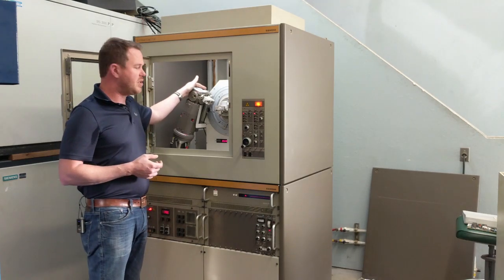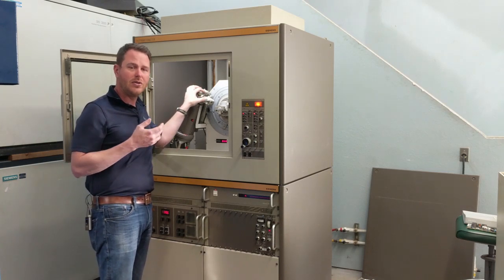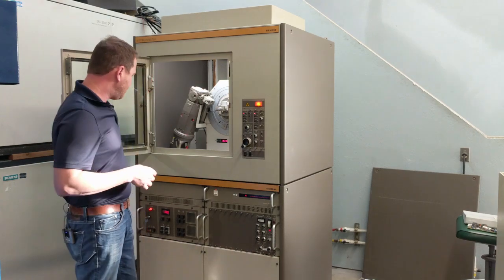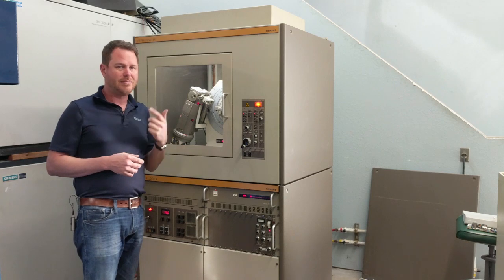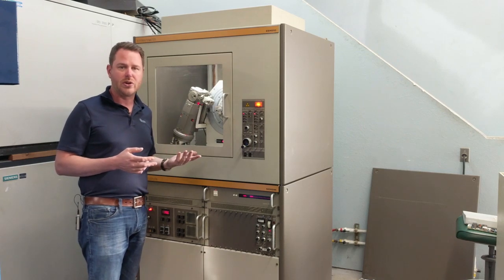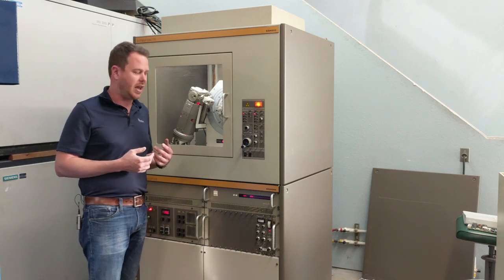The D500 Series II added a provision for a primary beam solar slit, which we discussed in another video — this dramatically reduces axial divergence and improves the symmetry of our peaks. All in all, the D500 makes excellent scan data. It's capable of very, very low starting angles, avoiding any air scatter with its point detector. We can easily start scans under one degree if needed, and even with the most common slits, we would start our scans at as low as two degrees with minimal air scatter.